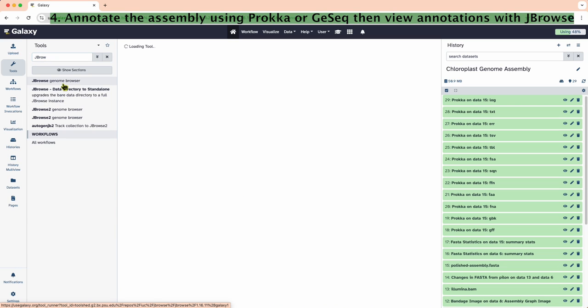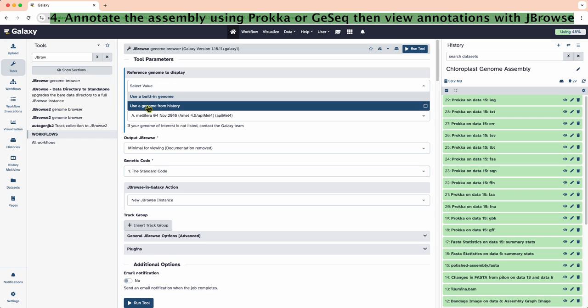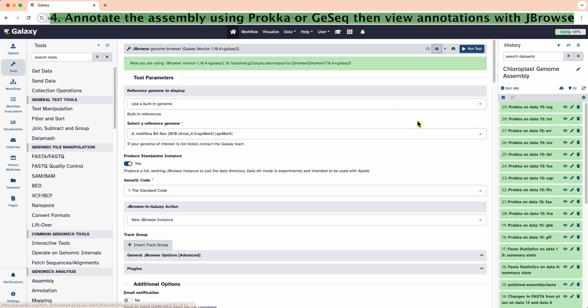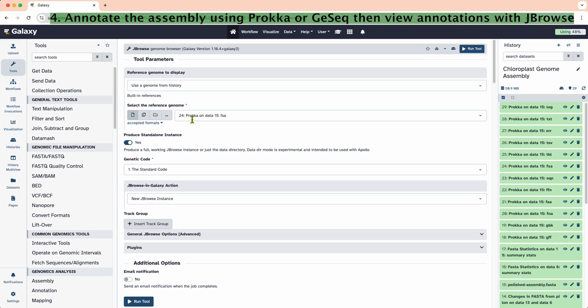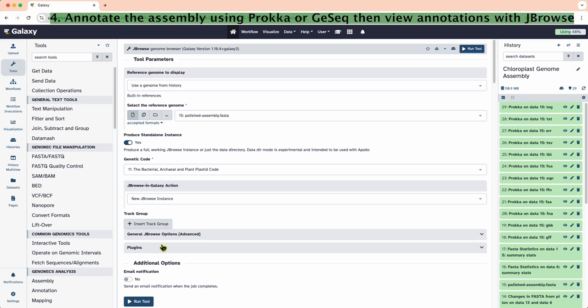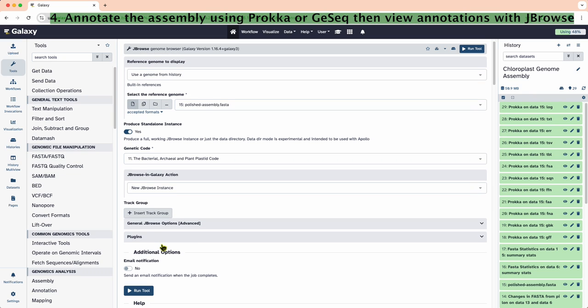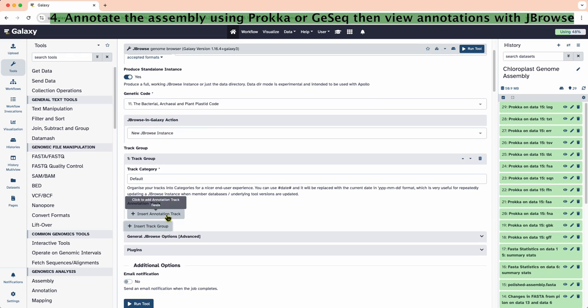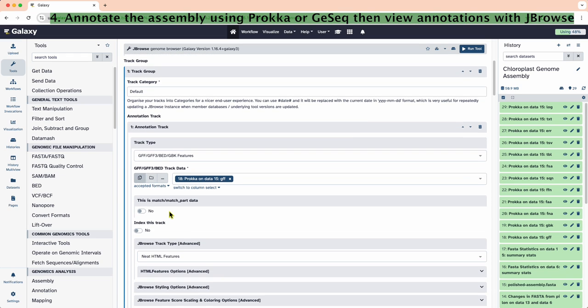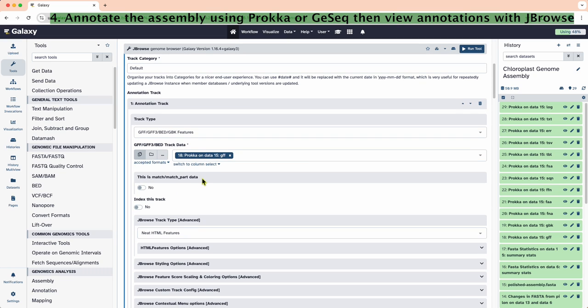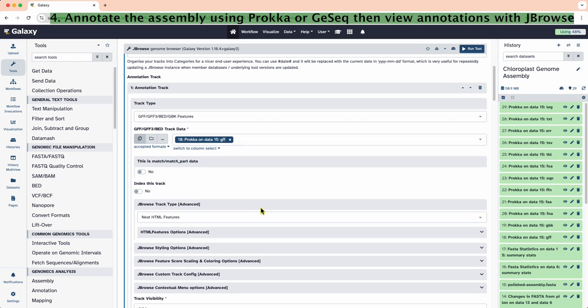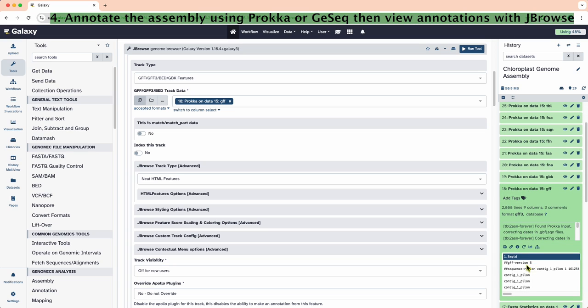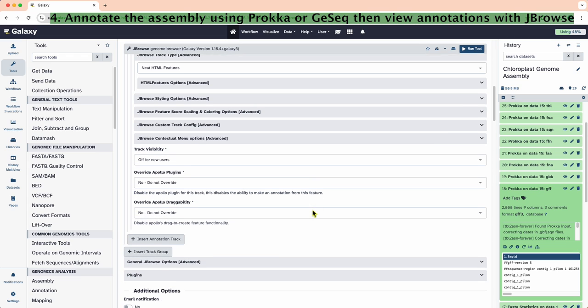Next, we will view the annotation file using the JBrowse genome browser. In this step, the tutorial indicated that we needed to use the JBrowse Galaxy version 1.16.4 plus Galaxy 3. We want to view the polishedassembly.fasta file using the plant plastid genetic code. We are doing a new JBrowse instance. We will insert a track group, then insert an annotation track. Choose the type GFF/GFF3 bed features and select the GFF file from Prokka. Now we hit run.